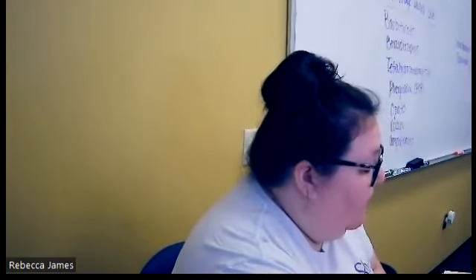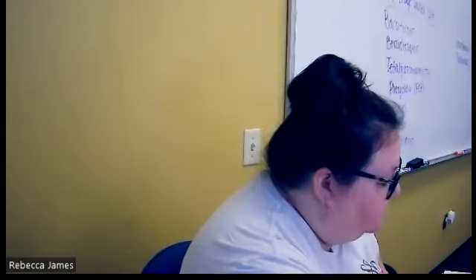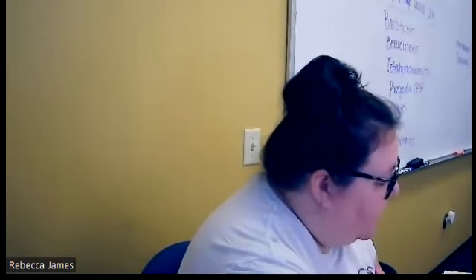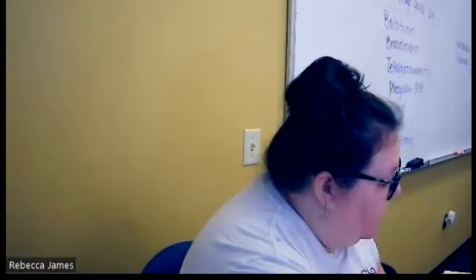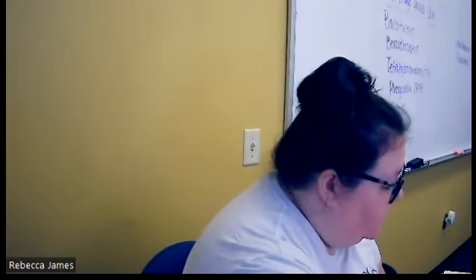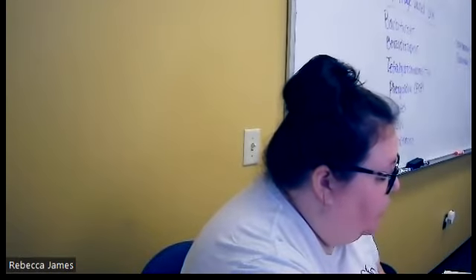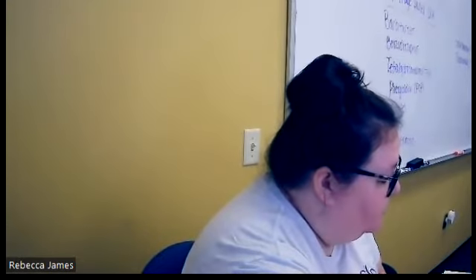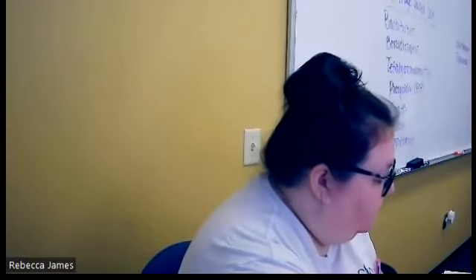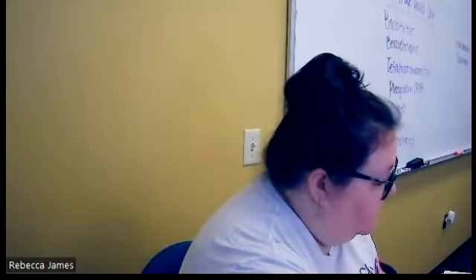Stool that appears black may indicate bleeding in the upper GI tract, whereas if you have fresh blood, it may indicate bleeding in the lower GI tract. Any portion of the stool that contains blood or blood-tinged mucus should be selected for wet mount preps and placed in a preservative. Go to the next sentence.